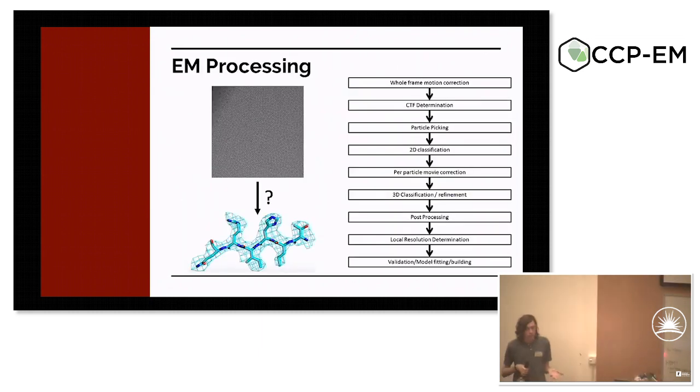So, you're all aware of the EM pipeline and how you go from your noisy, low-contrast image to your beautiful, hopefully 3D structure, which tells you all your new, interesting biological insight. And as biologists, that's what you care about. For a lot of you, you don't care about the steps in between, how they work, what they do. You just want them to work and you want them to be painless. So that's where we come in.